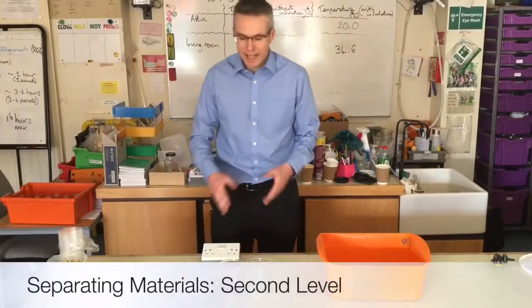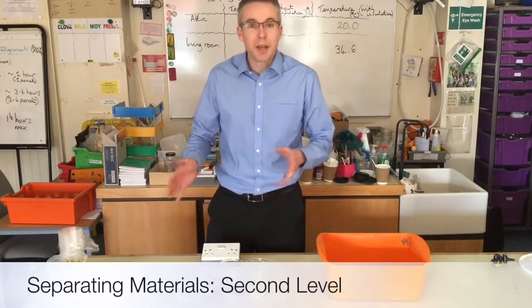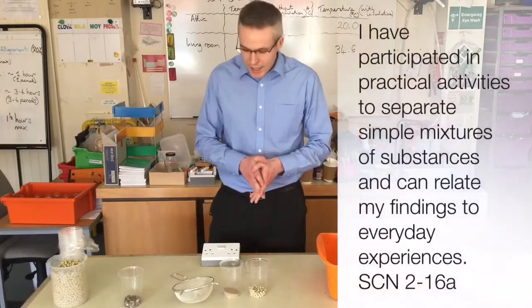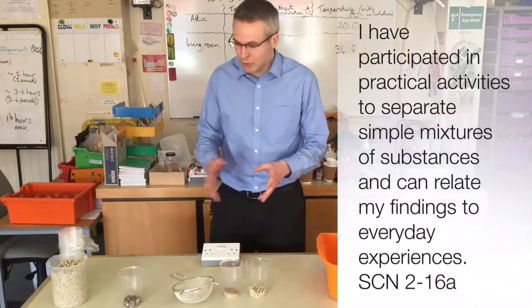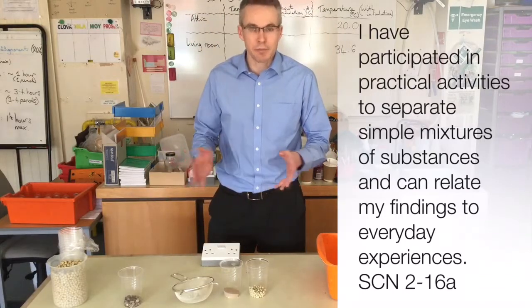Okay, we're going to look at some experiments today to look at separating materials, and this is a second level outcome. We're going to start off with a few little simple experiments with materials that you should have around your school or that you can easily get from a local supermarket.